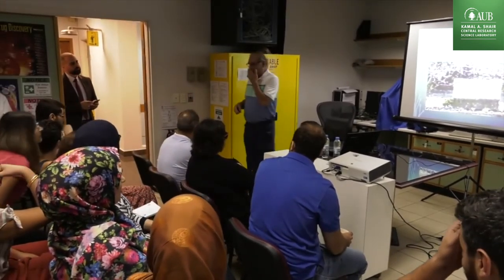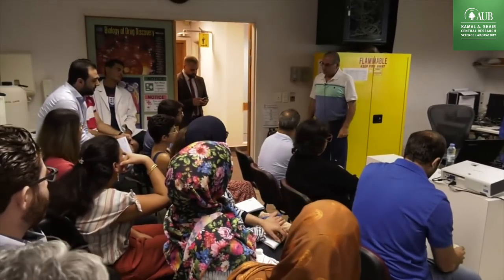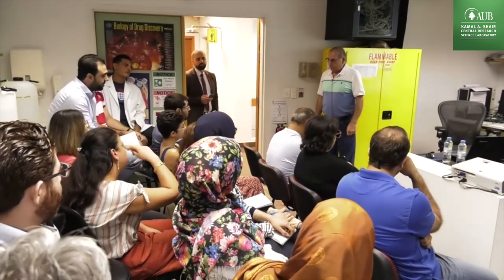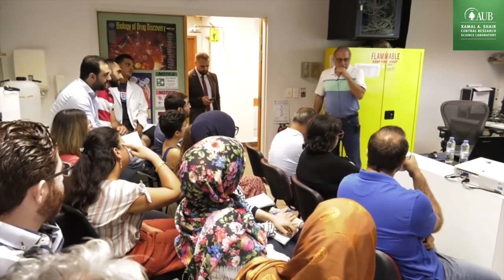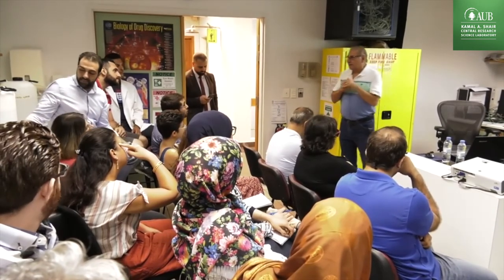I have one question. Concerning CO, you said that there is a debate whether one or two stoichiometric. And you mentioned the striking difference, 30% dispersion, 60%. First, was there a solution for this debate to reach a clear fact? No. Second, won't it differ between 30% and 60%? Yeah.